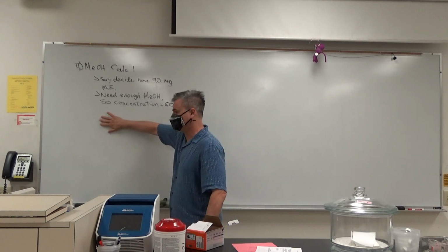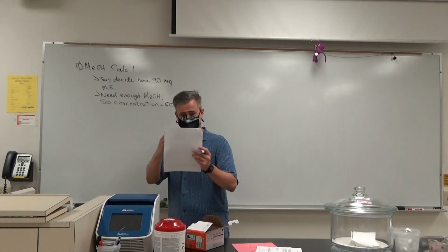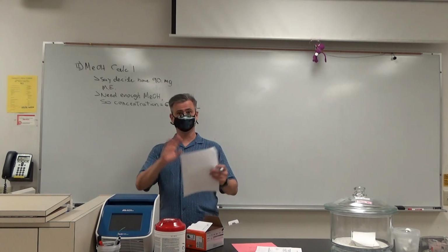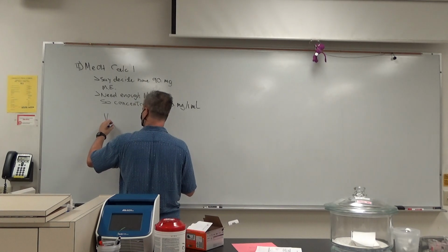All right, I'm going to put something here that says what all this stuff is. You hit an exam, and people haven't done that. Sometimes there's just calculation up here and calculation down here, and you have no idea. There's no units. So the calculation title is volume of methanol.